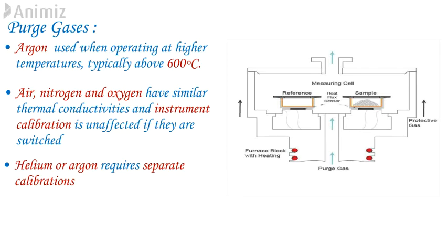If you want to check for a gas flow, do not put the exit line into a beaker of water. Suck back can occur, destroying the furnace, and bubble formation causes noise. A soap bubble flow meter can be used if needed, but any device used to measure a normally low purge gas flow should not in itself cause a restriction.